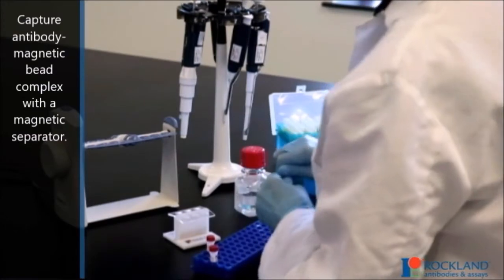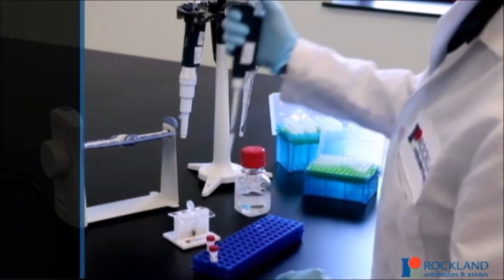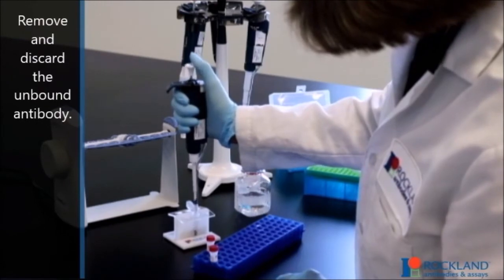Capture the antibody-magnetic bead complex with a magnetic separator. Remove and discard the unbound antibody.